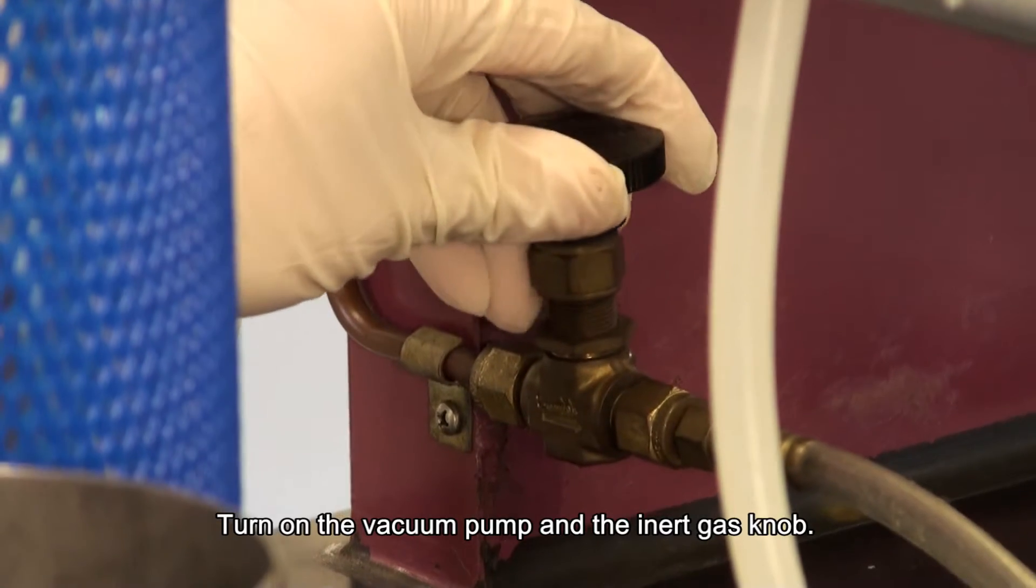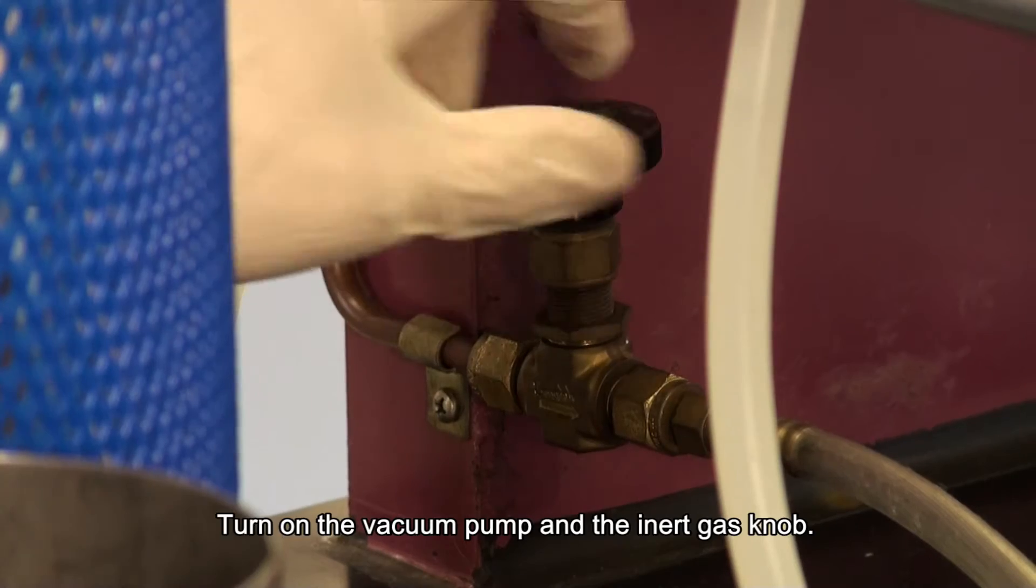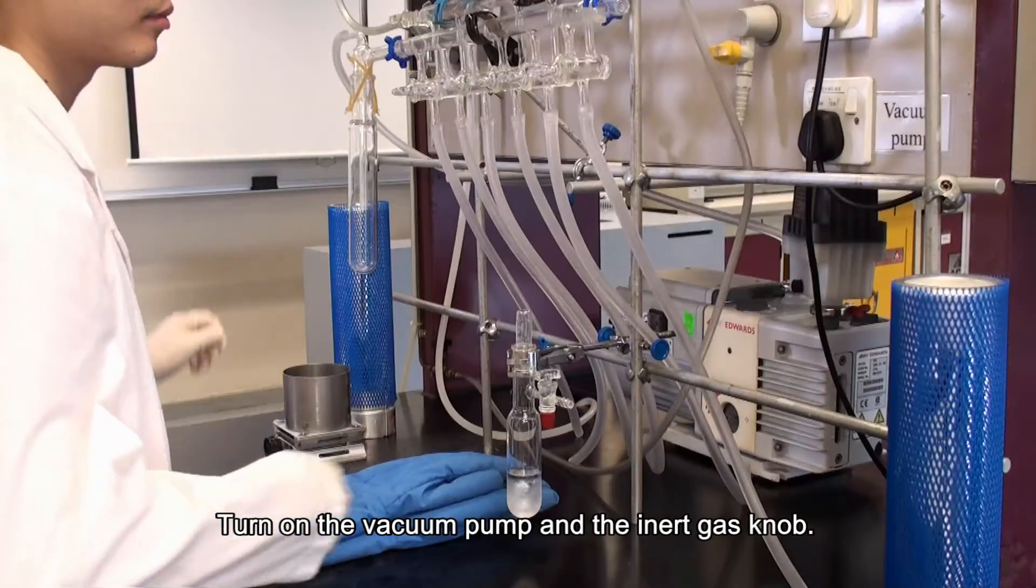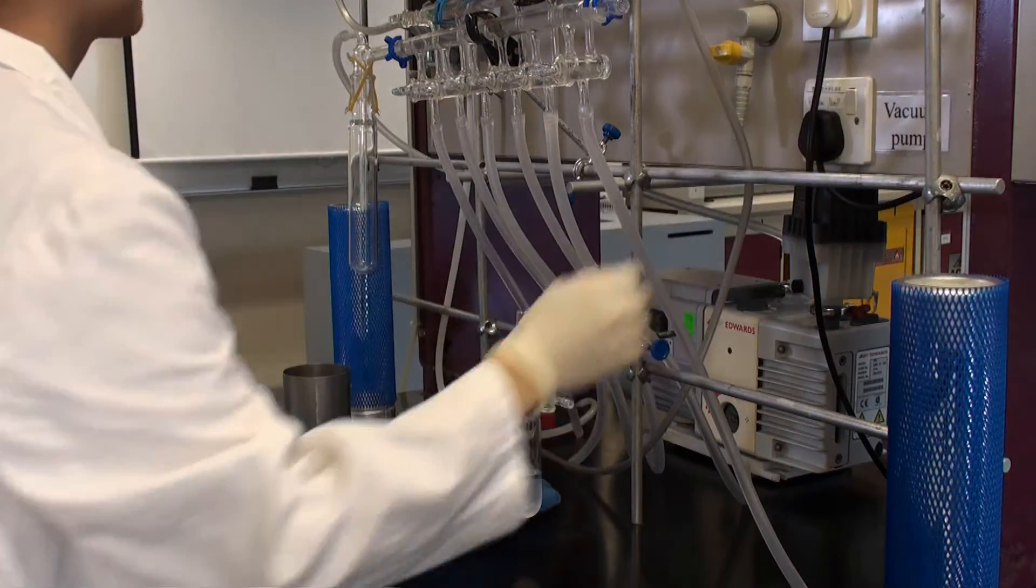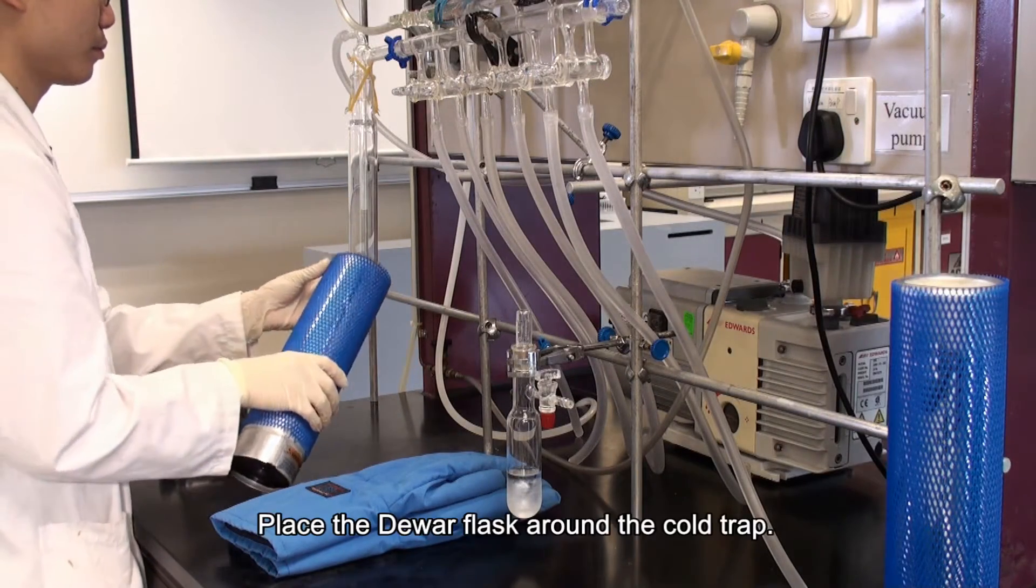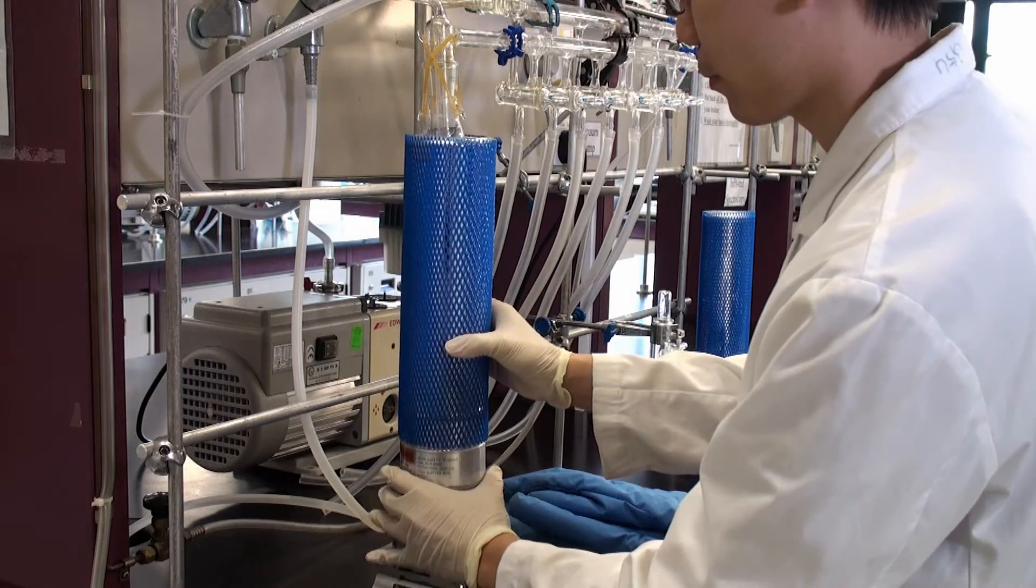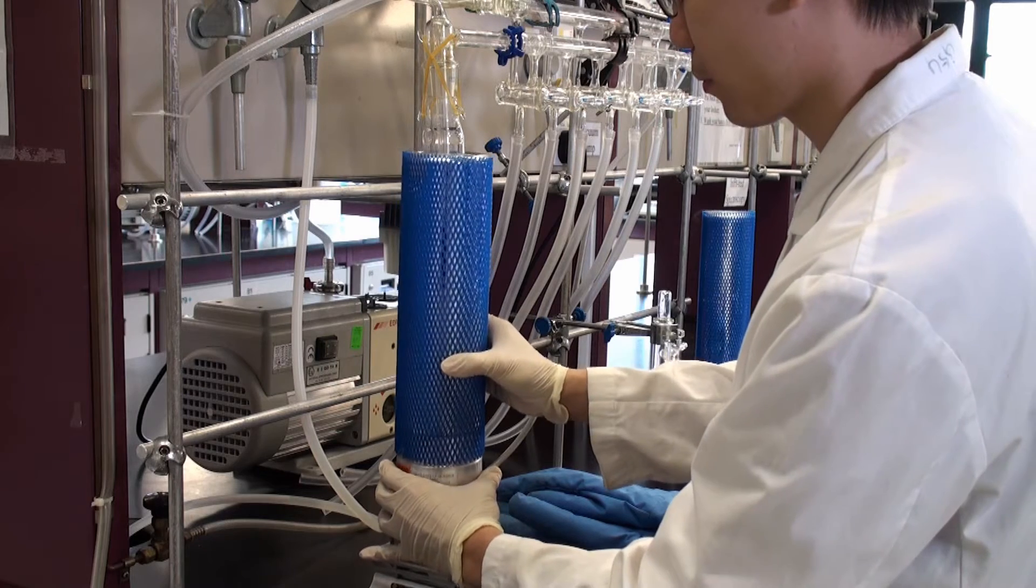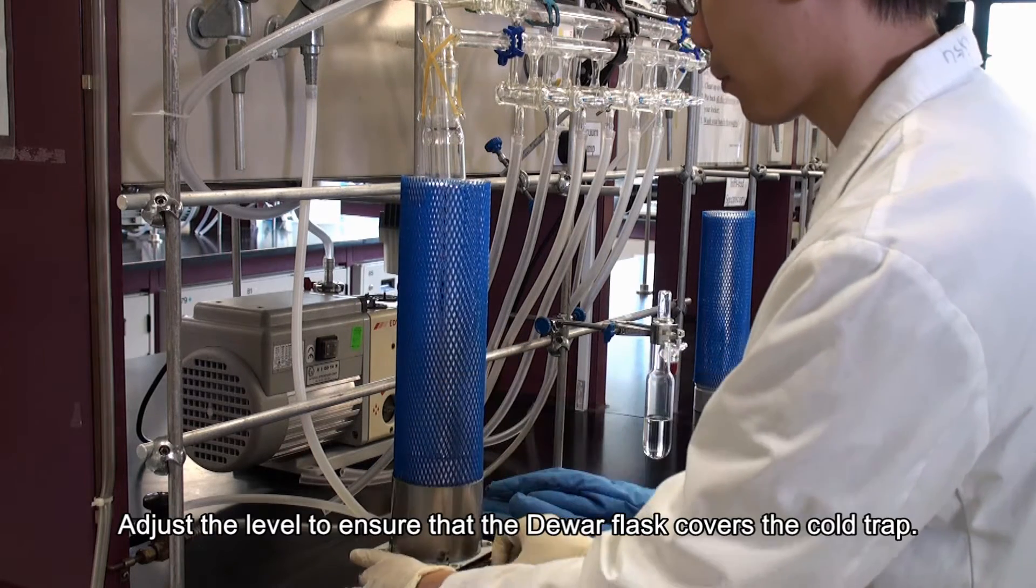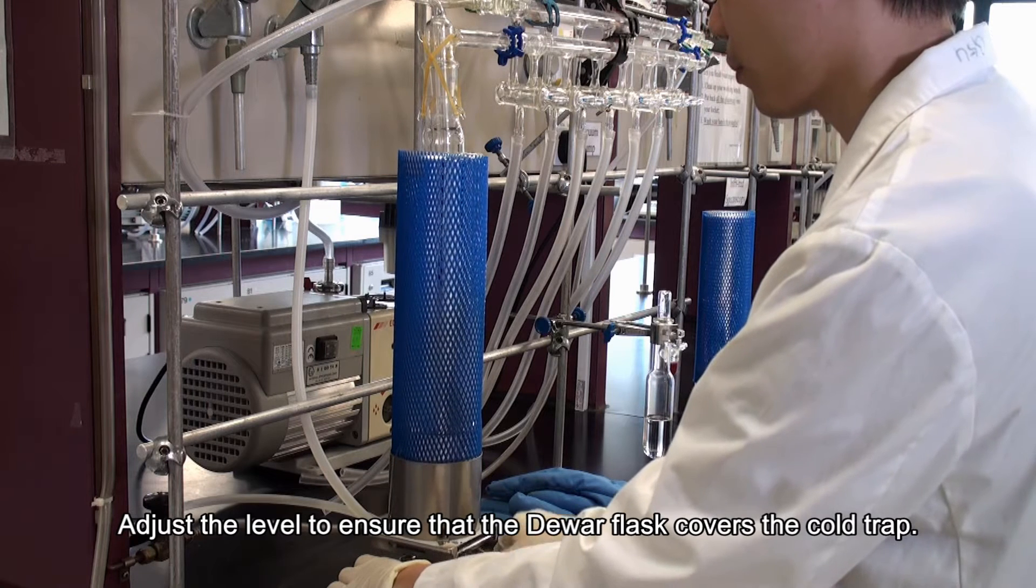Turn on the vacuum pump and the inert gas knob. Place the Dewar flask around the cold trap. Adjust the level to ensure that the Dewar flask covers the cold trap.